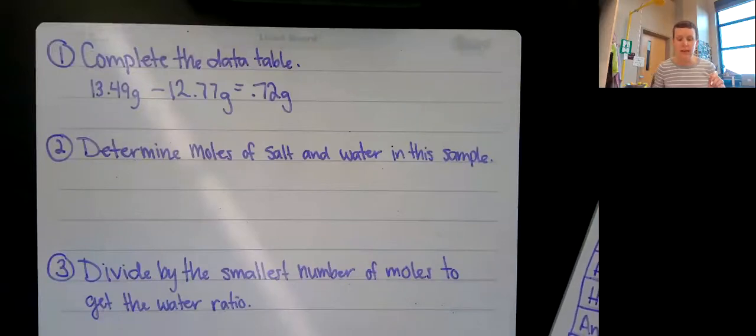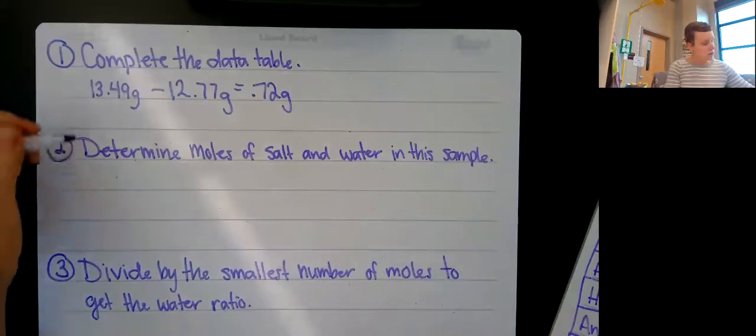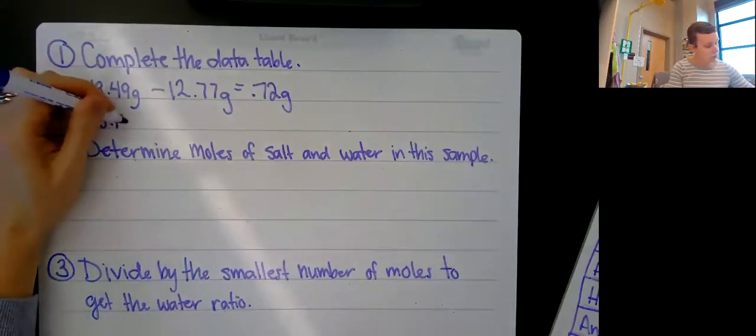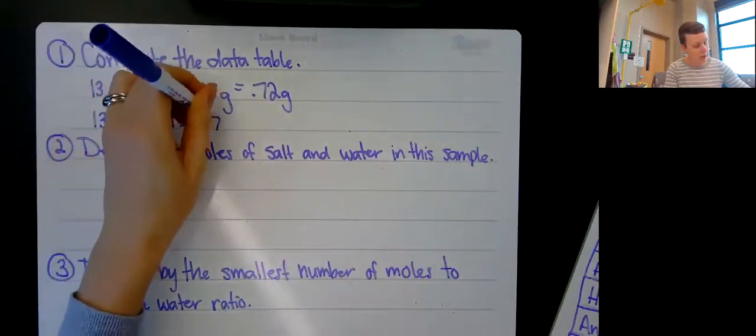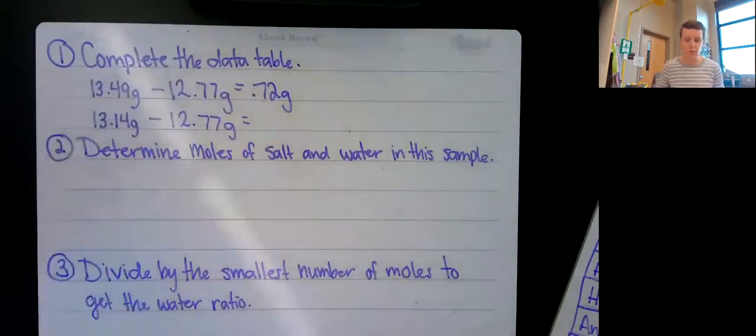Okay, next, the anhydrous salt. Again, in the data table, we have the mass of the anhydrous salt in the crucible, and we have the mass of the crucible. So we just do a little subtraction there. 13.14 grams, subtract the crucible. I mean, look at the words.